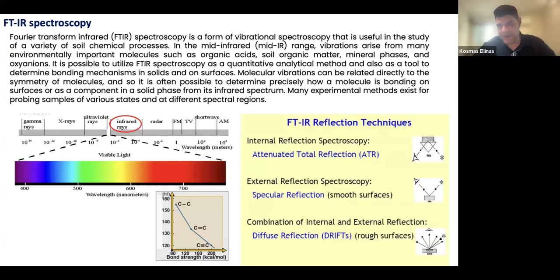And the last part of the characterization methods is related to the chemical composition of the surface. So in a lot of applications, we apply a thin film, we have a specific surface, and we want to know the chemistry of the surface.